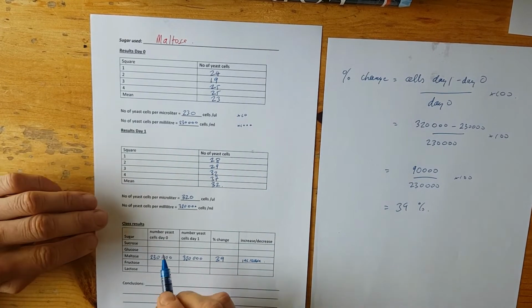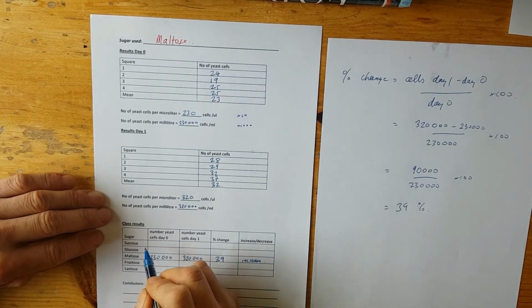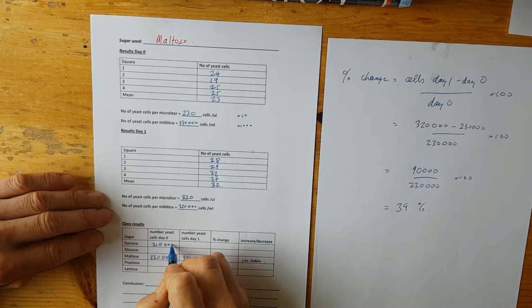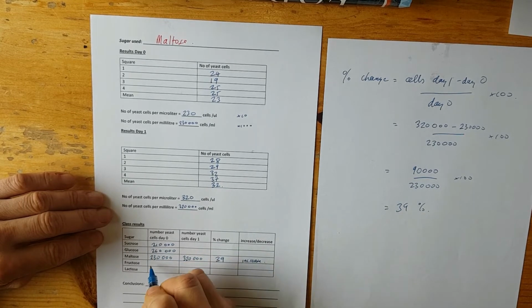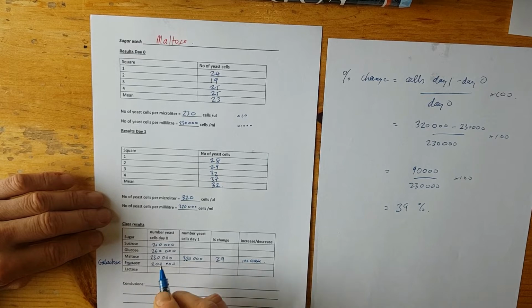And I've already done the other counts, so I can put those in here. For sucrose, 210,000, 260,000, 200,000, and that was galactose.